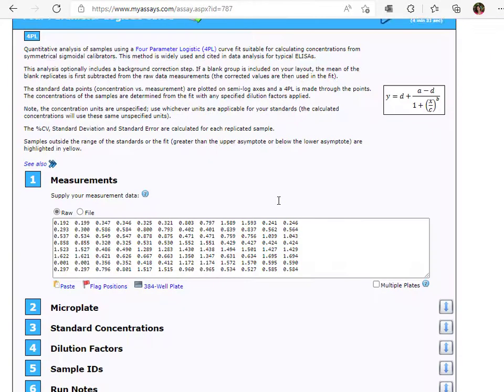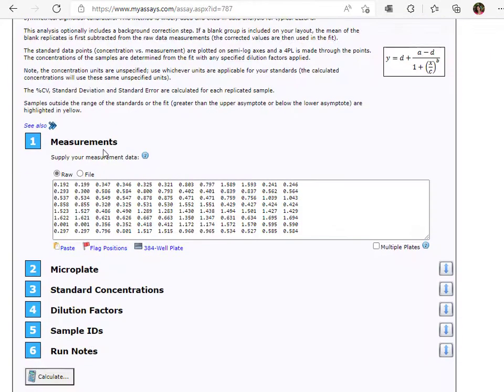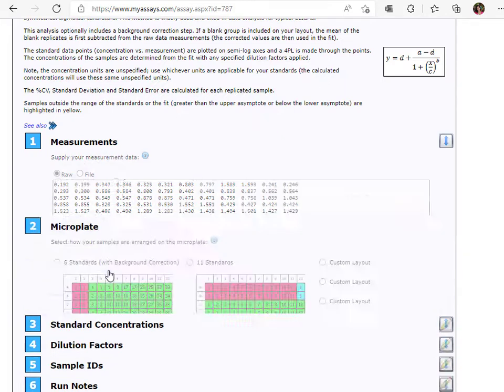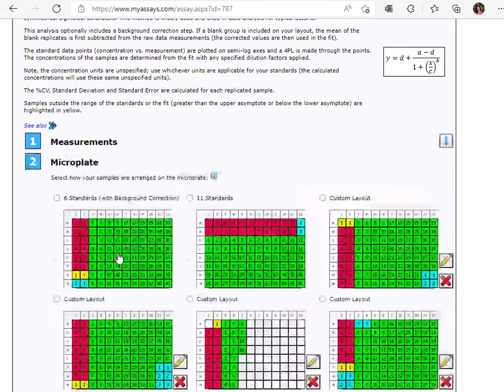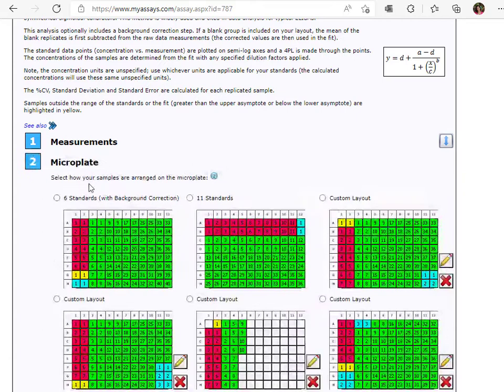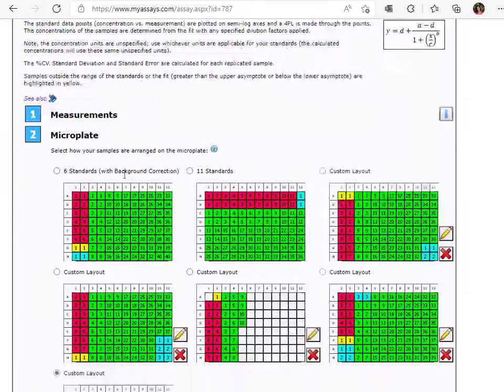Configure your assay settings by using these six tabs. Enter your measurement data using the Measurements tab. Specify the corresponding plate layout using the Microplate tab.